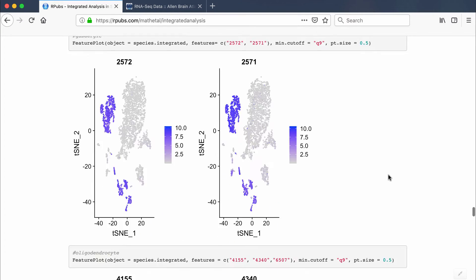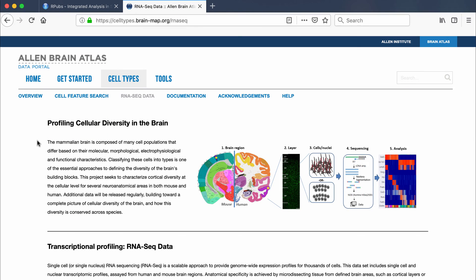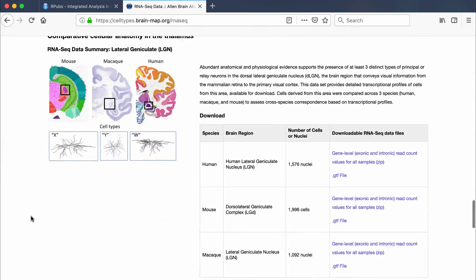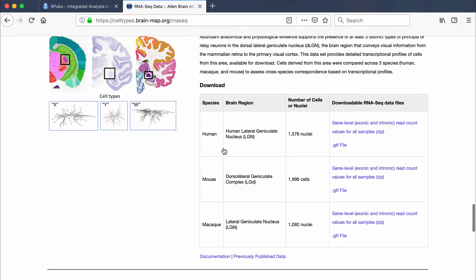You can also do cluster labeling, and at the bottom you can produce frequency tables to show the frequencies of different cell types across species or conditions. This analysis uses a publicly available dataset from the Allen Institute — specifically human and mouse single-cell RNA-seq data from the lateral geniculate nucleus and the equivalent dorsolateral geniculate complex in the mouse.